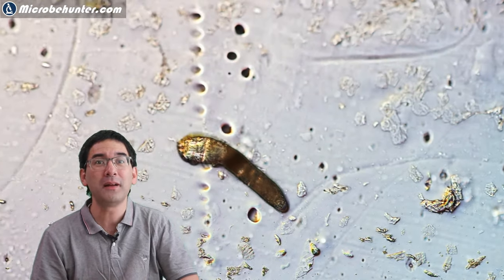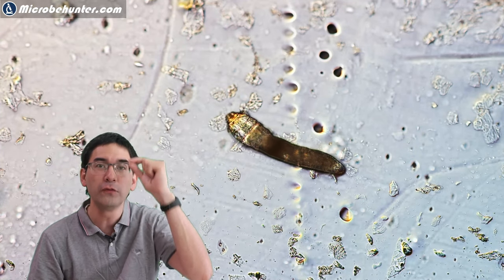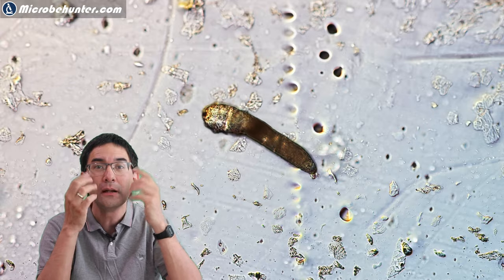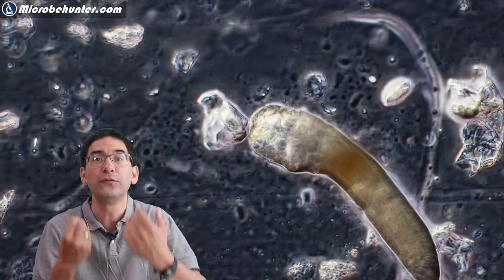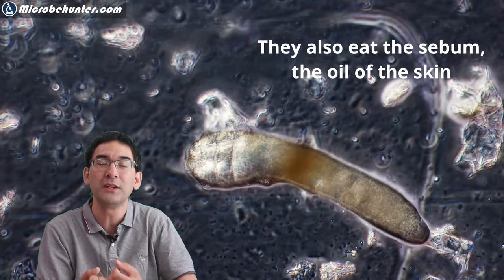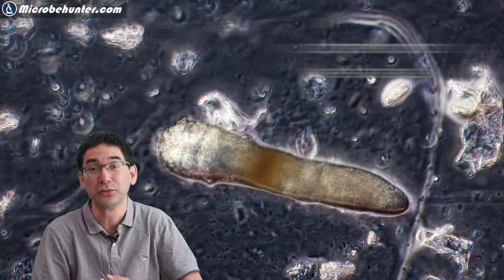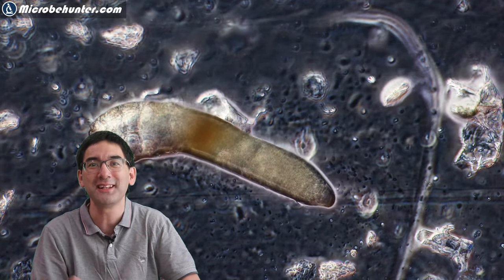If you want to isolate those face mites yourself, put some tape over your forehead or nose — those places where there is a lot of oil and grease, because this is how they feed. They absorb the oil and grease through their body, and that's how they grow. At night they come out to mate, produce eggs, and then you have the next generation.